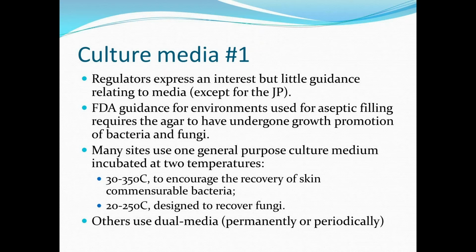However, the FDA guidance for aseptic filling, which was last revised in 2004, does state that agar must have undergone growth promotion testing for bacteria and for fungi.